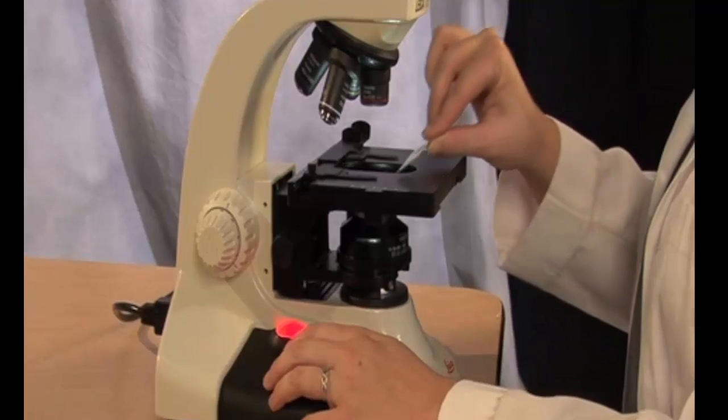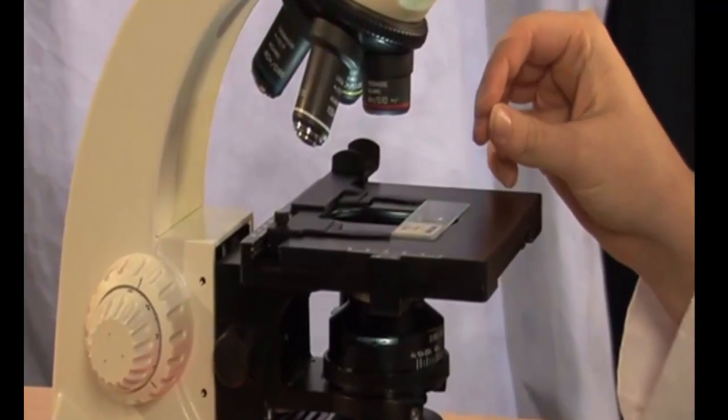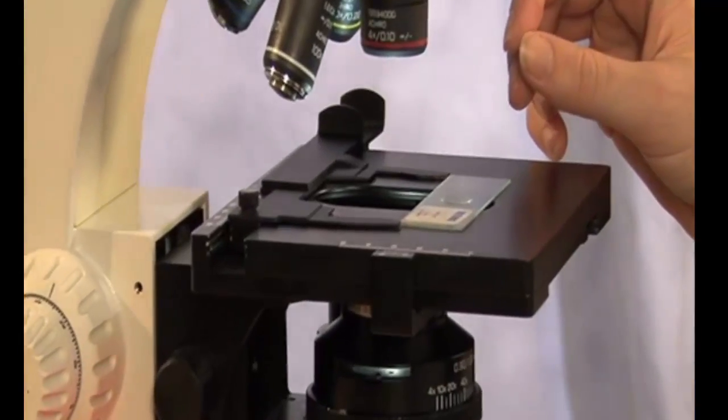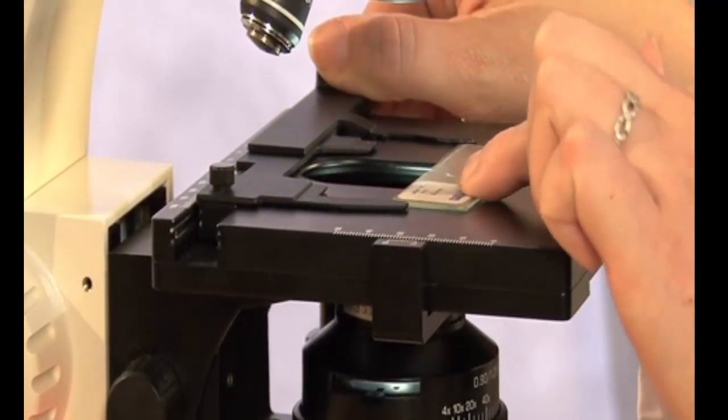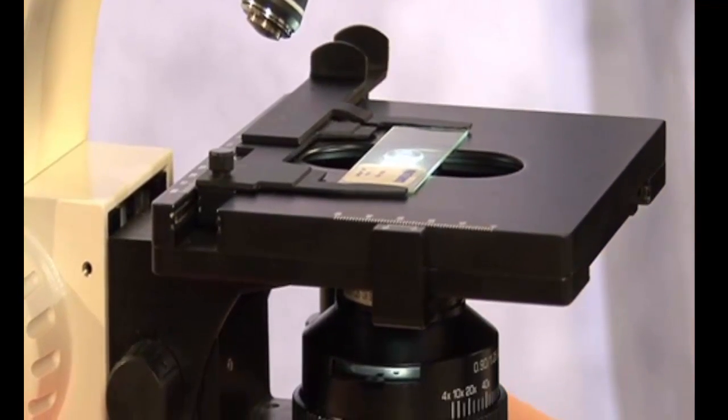To place a slide on the stage, bring the stage a little forward. Place the slide down on the stage and squeeze the clips together as you slide the microscope slide all the way to the back and to the left. Then gently release the clips.